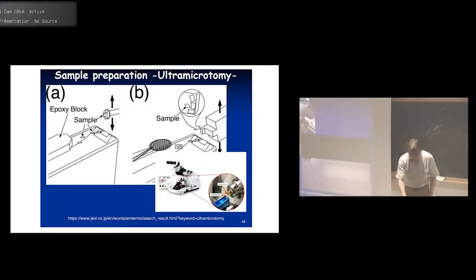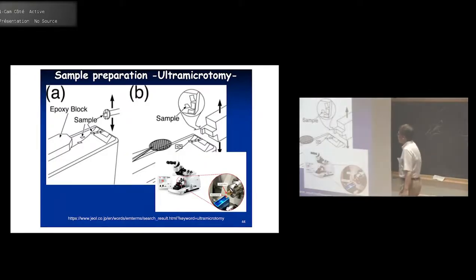Okay, and other things, I got a suggestion from Professor Creighton that some of you asked questions about how we're going to prepare a sample for the TEM. Okay, that's microtoming, and I tried to find a good schematic picture inside my computer. This is what I got, and the whole instrument looks like this. And the size is about that, so you can put that on the desk. So it's not that big an instrument.